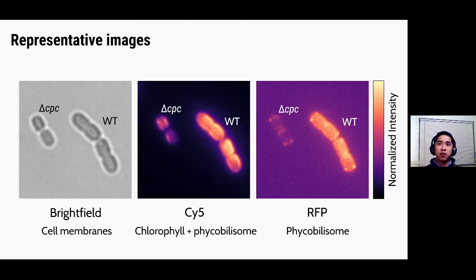So here are some representative images showing what these cells look like under the microscope. And you'll see that basically we have two populations of cells here. The smaller cells here are the delta CPC cells, and then these larger cells here are the wild-type cells. You'll notice that in the fluorescence channels that the delta CPC cells always look a little bit dimmer than the wild-type cells. This is obviously most apparent in the phycobilisome channel, where these cells are very dim due to the fact that they no longer have the phycobilisome rods.